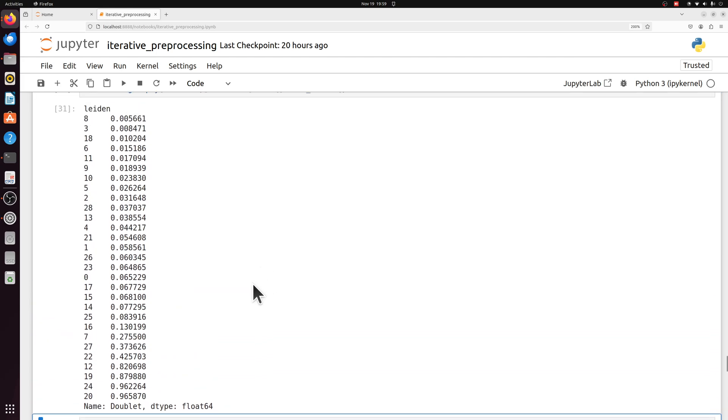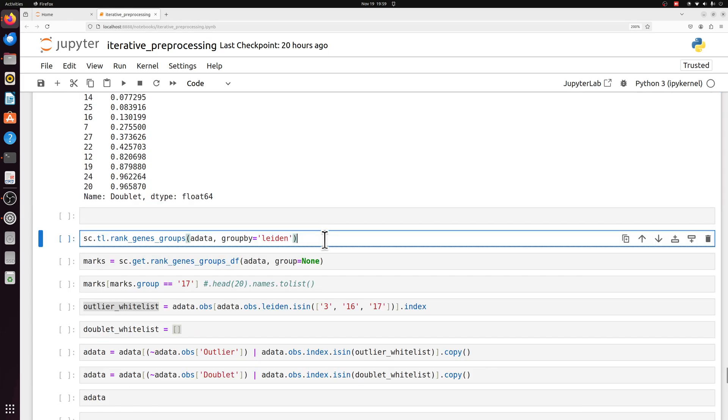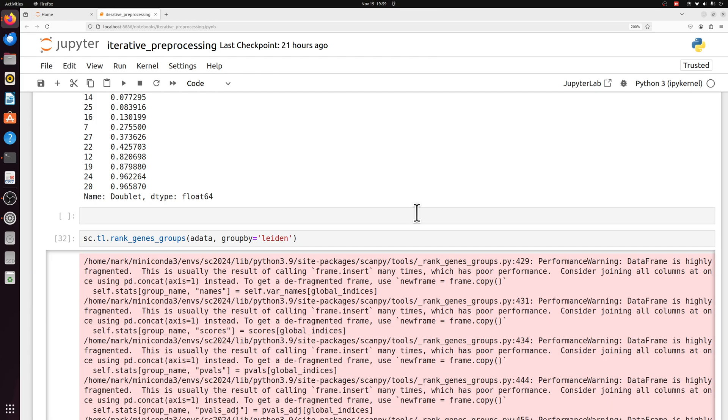We can do the same thing for doublets. Some of these small populations might actually just be populations of doublets, but again, I think it's better to actually determine that by showing that they have a mixture of markers instead of just getting rid of them. So let's actually look at some of these marker genes just to quickly annotate these three populations. I'm kind of taking a shortcut here. I'm not going to label all the populations like you should just for the sake of time. I don't think it's ever good to just label one or just a few populations because you have to disprove that it's not another population. Just because it has a marker for one type of cell doesn't mean it's not another type of cell that also expresses that marker.